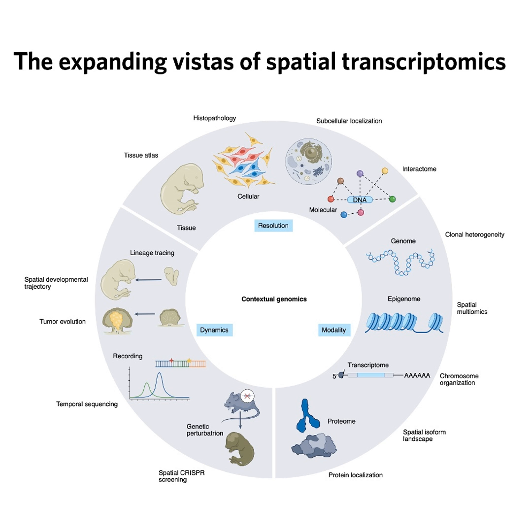However, it's often limited by a fairly low conversion rate of the original RNA into the final signal you can detect. It's technically quite challenging. Okay, so you've got ways to make the RNA targets light up. Now for the magic trick, as it were, the multiplexing. Once the RNA is labeled, how do they actually read out thousands of different gene types?